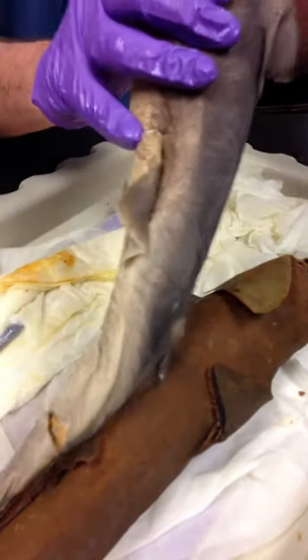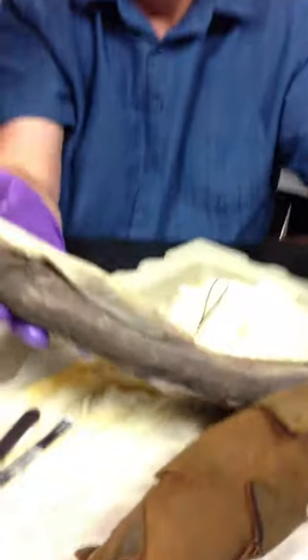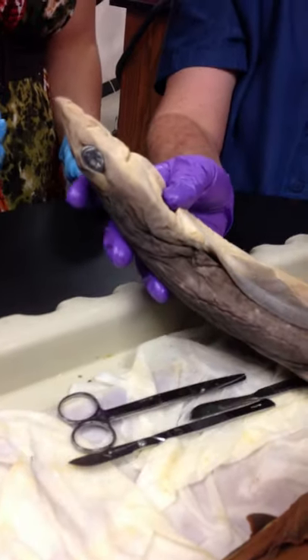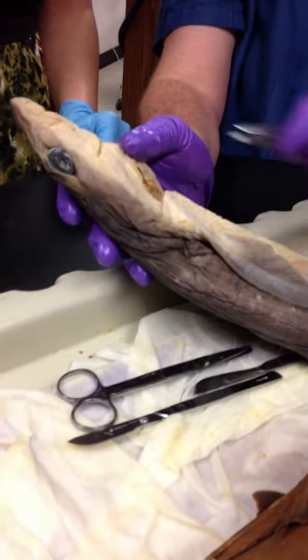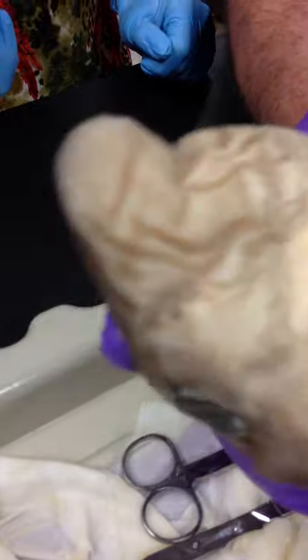And then it's just for Colleen to see. There's a benefit to wearing gloves, right? So if Colleen looks right here on the nose, I'm going to moisten it a little bit. And wipe your nose. Clean your face, Mom. I know. You can see all these little pits right here. See those little pits? I'll show other people, too. See the little pits?